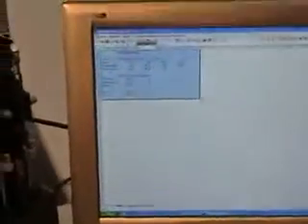At the same time, we have also activated Excel in the background. And when we have a look into the Excel file, we see the report for the surface energy calculation on this point. Of course, more transfers of those data can be done into Excel.